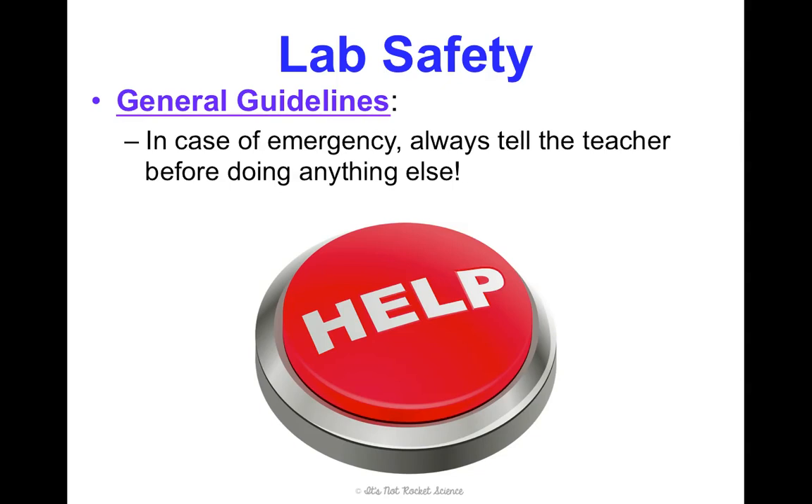If there's ever an emergency, always tell the teacher before doing anything else. Even if you think it's not a big deal and you can pick up the broken glass yourself, please let me know — because sometimes it's a bigger deal than you think and we really need to make sure we clean up and handle it properly. Please tell me if anything happens.